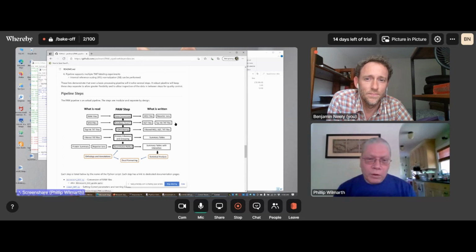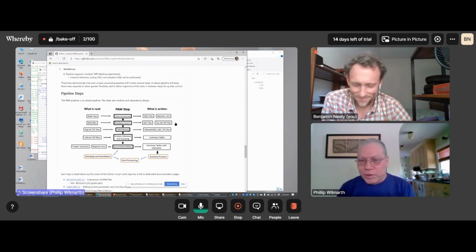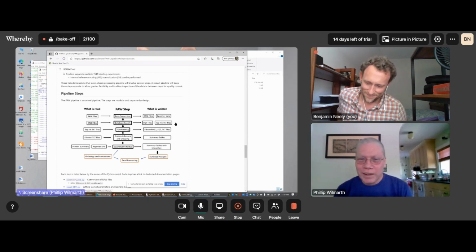And then one of the other interesting things about Comet, when you've got a peptide that matches to multiple proteins, Comet will tell you the first protein accession in the FASTA file that contains that peptide, and then it'll tell you how many other proteins also contain that peptide, but it won't tell you which proteins they were. So it'll say, here's an accession, here's a peptide sequence, and then it'll say like +5. That means there's 5 other protein sequences that contain that peptide.